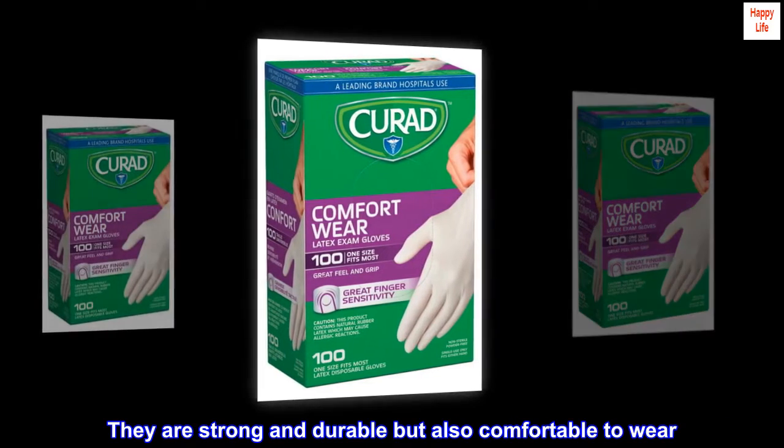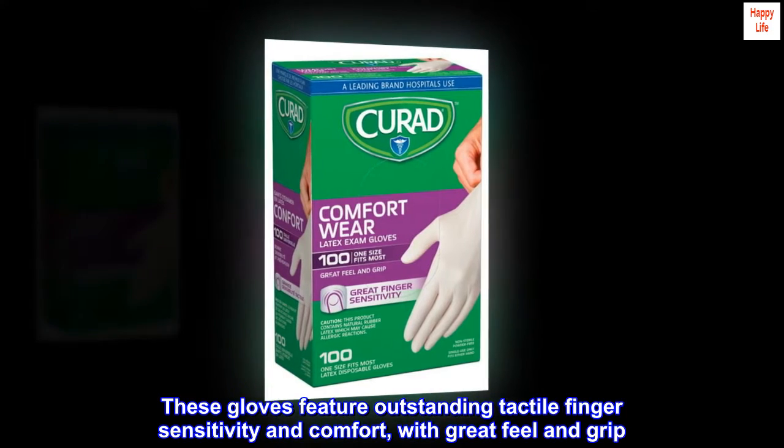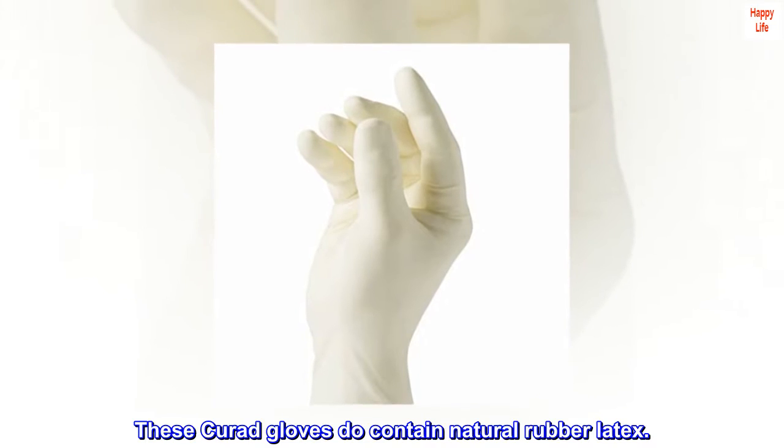They are strong and durable but also comfortable to wear. These gloves feature outstanding tactile finger sensitivity and comfort, with great feel and grip. These Curate Gloves do contain natural rubber latex.